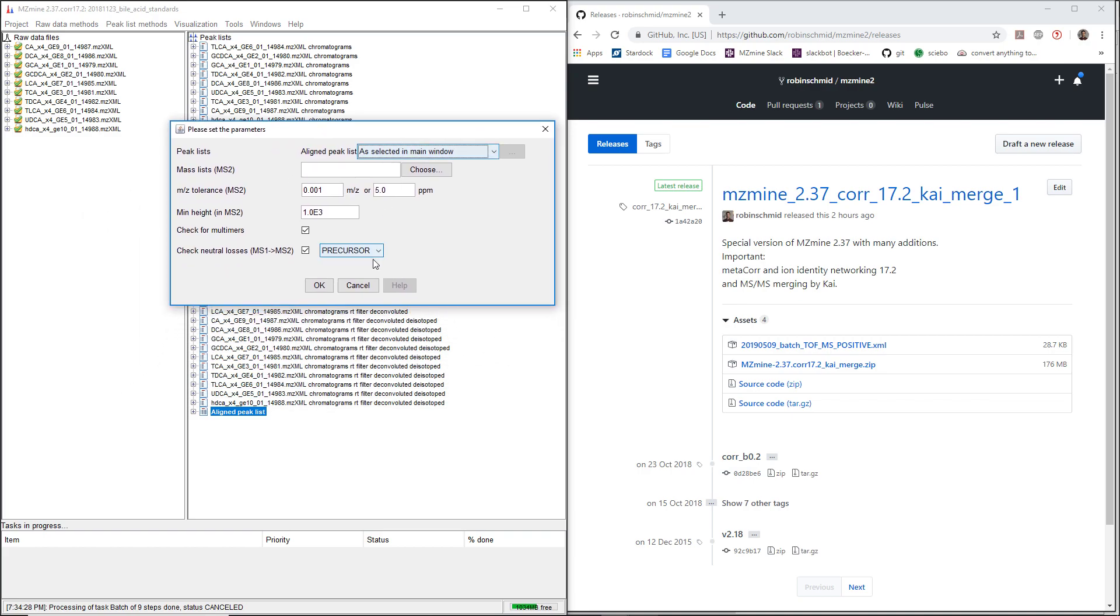This is basically checking multimers because multimers usually tend to fragment from, for example, 2M plus sodium, fragment down to 1M plus sodium.